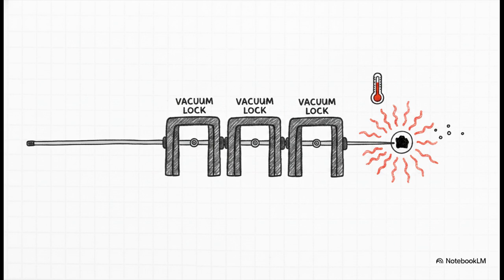The absolute key here is temperature control. The operator has to be so careful. You need to heat the sample just enough to vaporize it, but not so much that the molecule thermally decomposes before you can even analyze it.